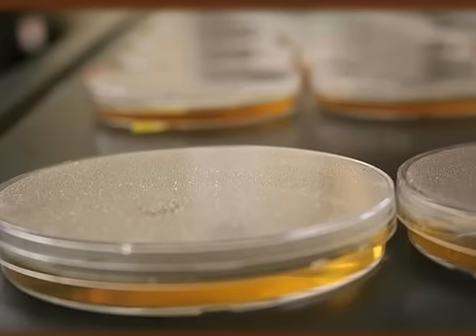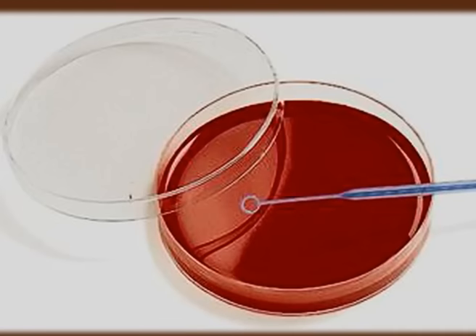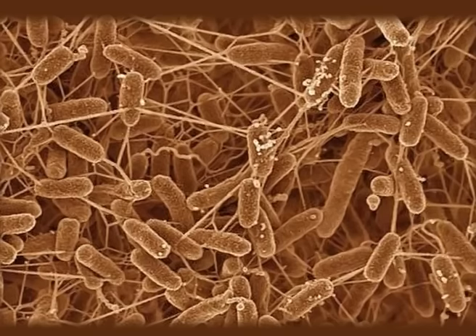What is a culture medium? Culture medium performs an important process in microbiological studies. It is generally composed of inorganic and organic nutrients mixed in a defined volume of water, adjusted to a suitable pH required for the growth and development of microbes in the laboratory.